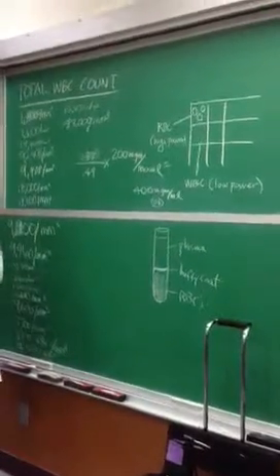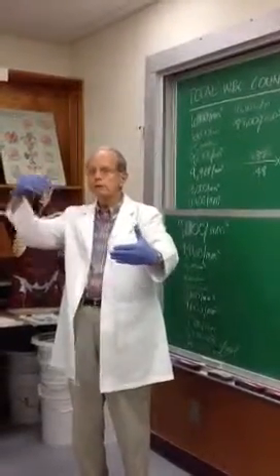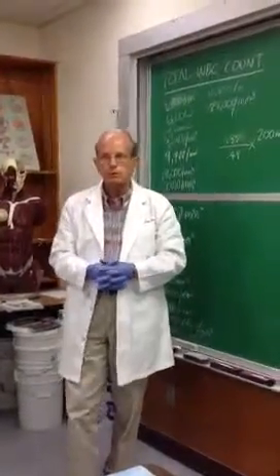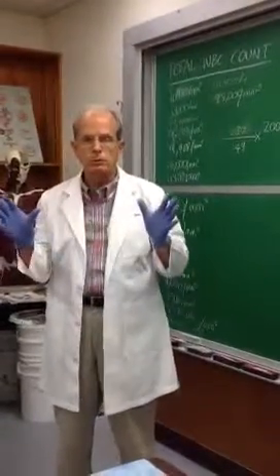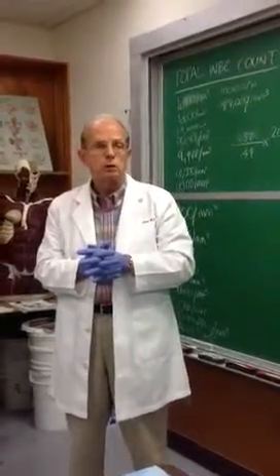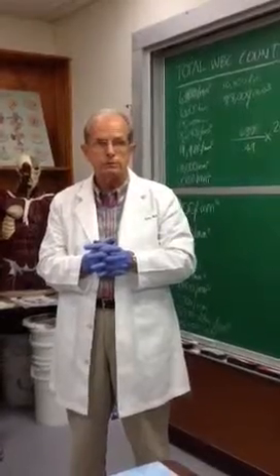Okay. So we zeroed our machine. We had a known concentration that we measured the optical density of, and we compared it to our unknown. The patient was the unknown. All right. Now, the normals in humans nowadays, and we'll talk more about this when we get to digestion and nutrition, but cholesterol should be no higher than 200 milligrams per 100 milliliters, and the lower the better, usually.